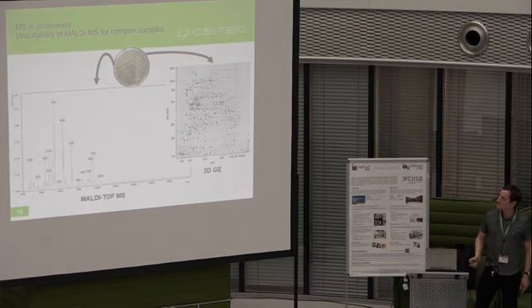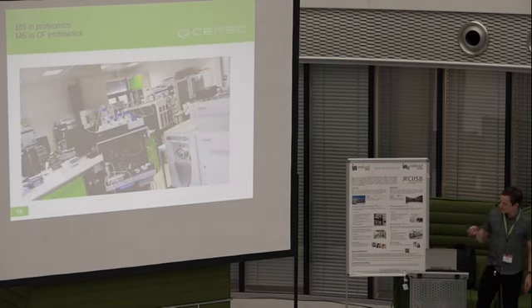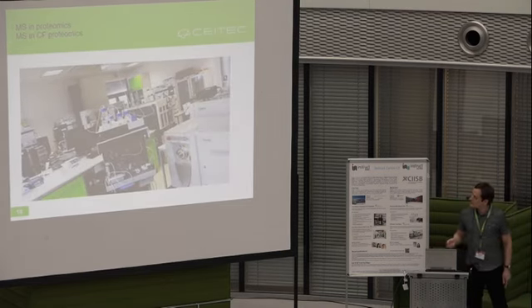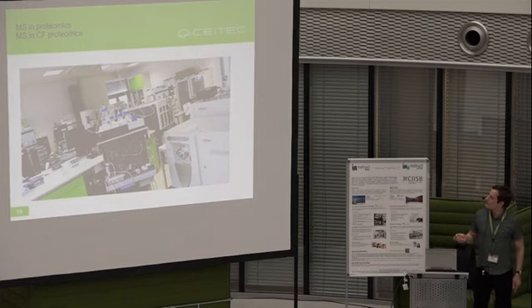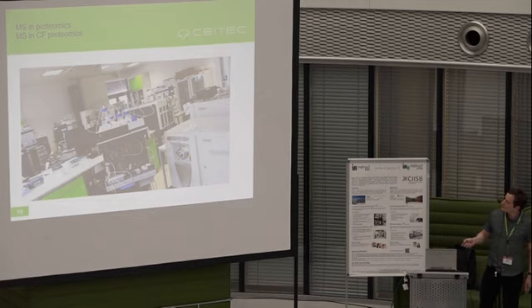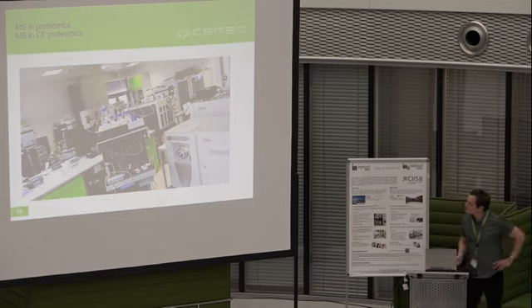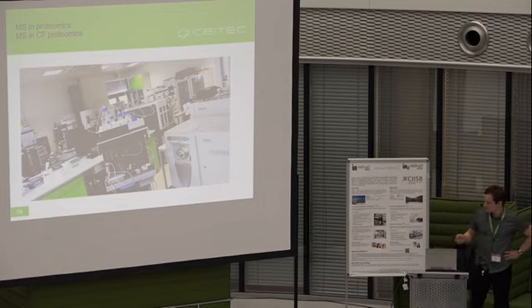So for the purpose of their detection and studying by mass spectrometry, you must couple the method to some separation step. For that purpose, we just applied several combinations of mass spectrometry coupled to liquid chromatography. This is the picture of our crowded laboratory. Maybe you would be curious, why do we need so many machines? You might guess this, as all analytical chemists like to have a lot of toys to play. Maybe you are right. Also, from time to time, some of the mass specs is out of order, so we need a substitute.